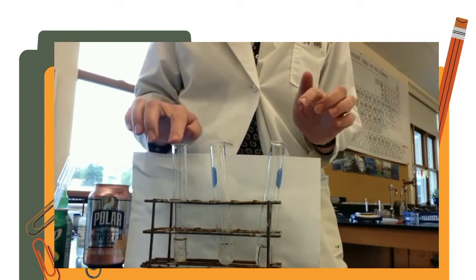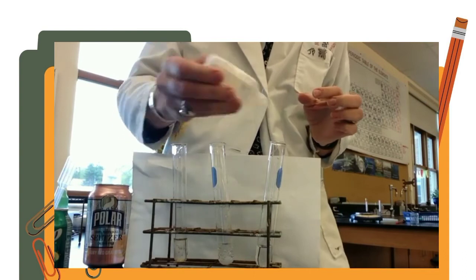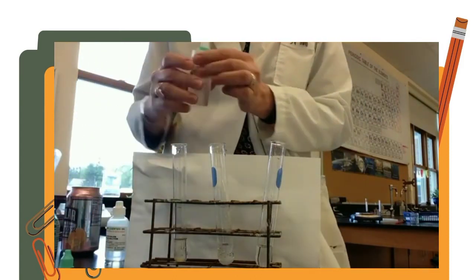So let's watch this. Right, second one is 7 Up, the third one is seltzer. I got 5 mils, 5 mils, 5 mils. In each one I'm going to put drops of phenolphthalein, which is an indicator. So 2 drops in the first one, 2 drops in the second one, and 2 drops in the third one. Again, the first one I'm going to titrate is Sprite. The second test tube is 7 Up, and the third test tube is full of seltzer. So we have sodium hydroxide, which is a base. So I'm going to count the drops and continue to swirl it.